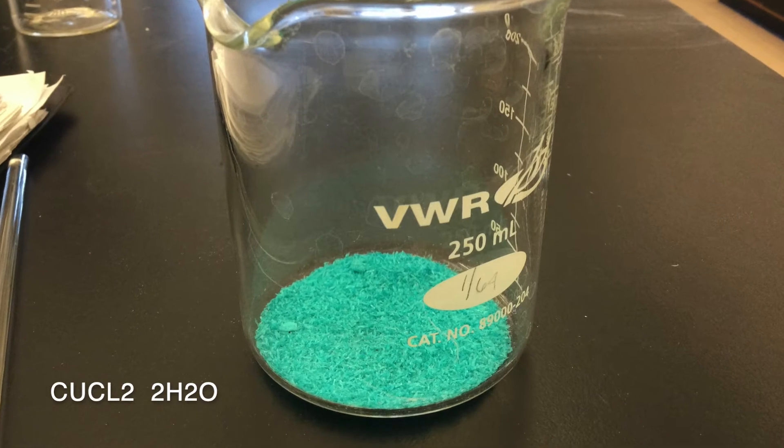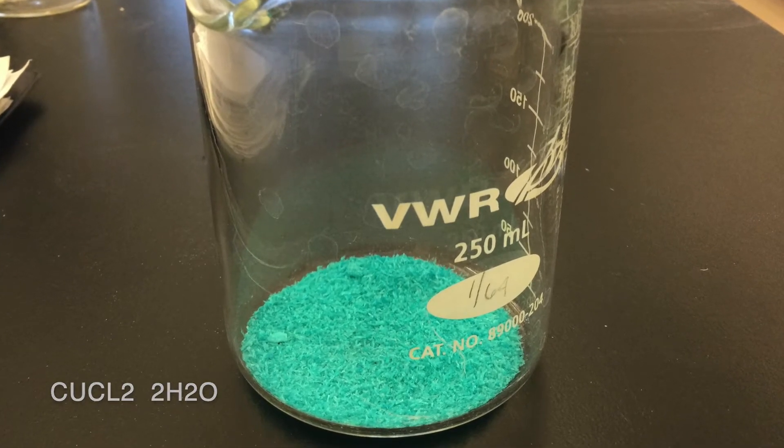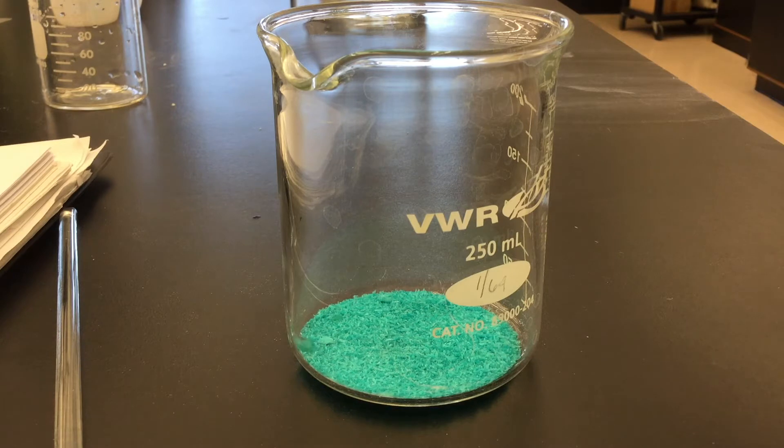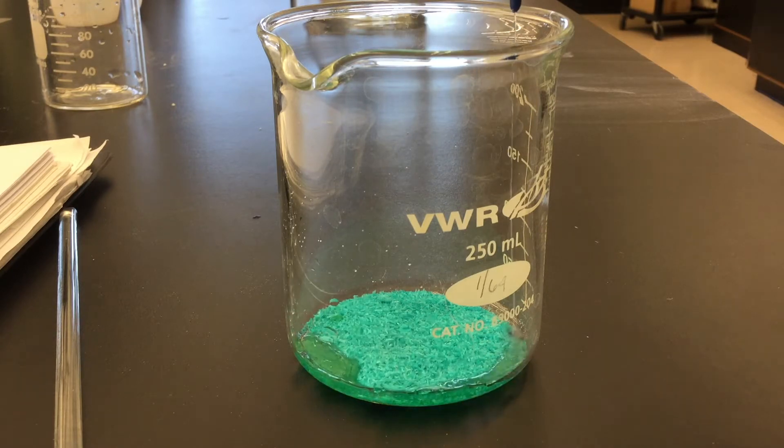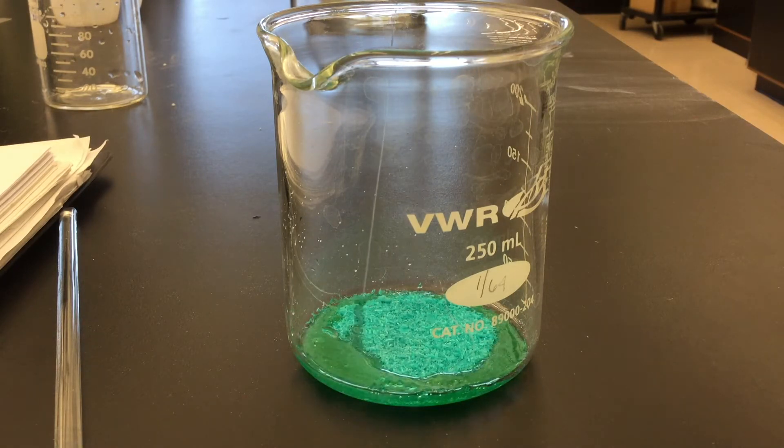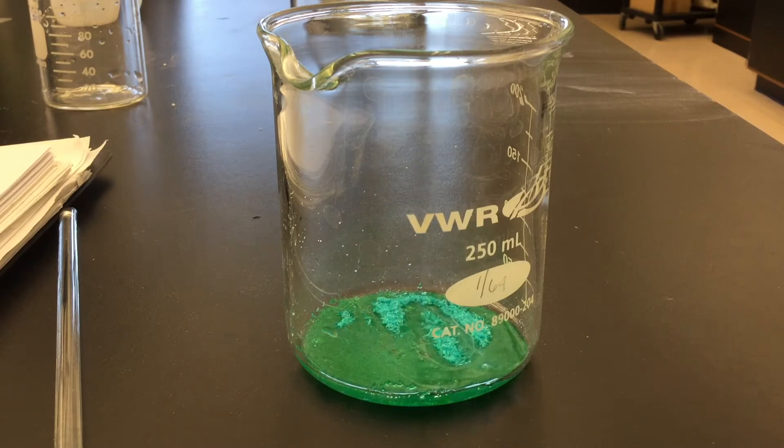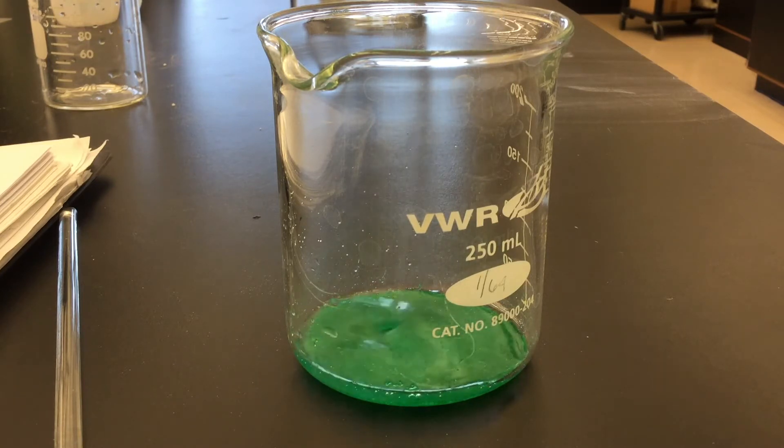Weigh out approximately 5 grams of the copper chloride dihydrate. Put it in a small beaker, wet it with deionized water, just a few milliliters, and then stir the mixture until it completely dissolves.